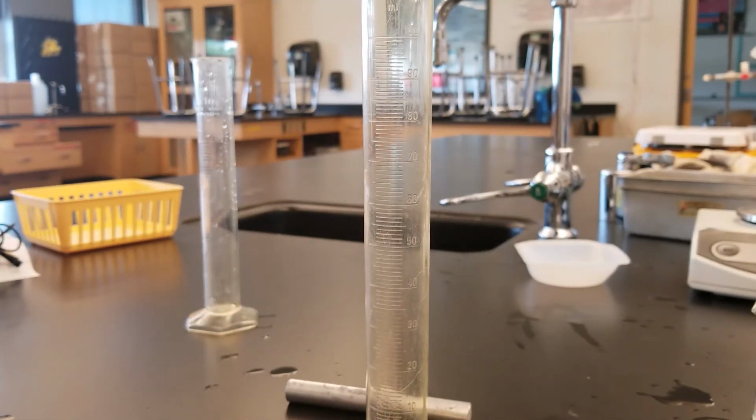Since object number 5, the 10 centimeter long silver rod, is substantially larger than the others, it is recommended to use the larger 100 milliliter capacity graduated cylinder. This time I'm going to put 50 milliliters of water in to start.